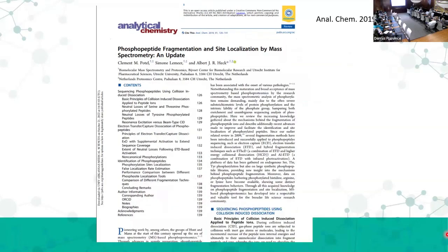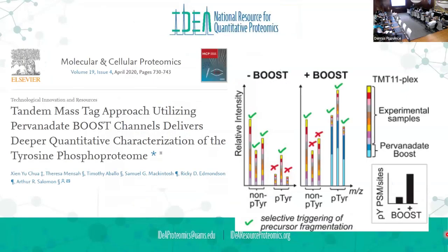And then this is a good overview. This was in 2019, again, from Albert Heck, who's done a lot of work with phosphopeptide enrichment and fragmentation.